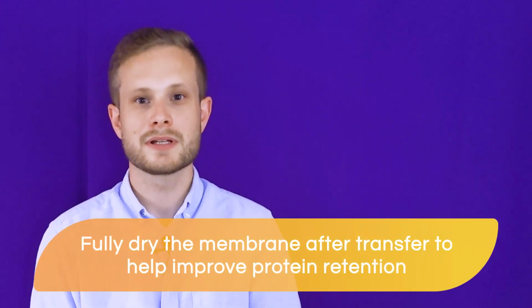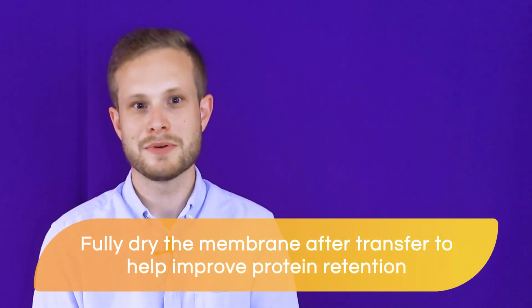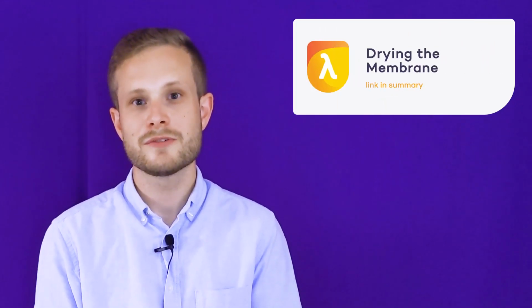But actually, this step can help to improve protein retention on the membrane, which can help to improve detection sensitivity and give us more reliable and consistent results. For more information on this, please refer to that course.